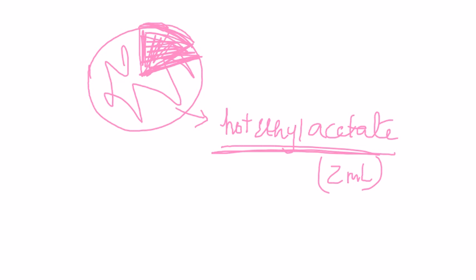If your solution is not saturated, you're not going to see the precipitation of your product. So it's a very good idea to keep the volume of the solution as low as possible.